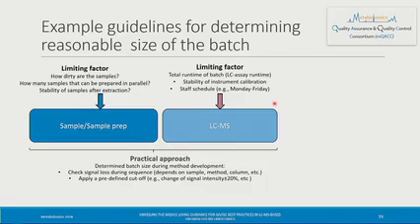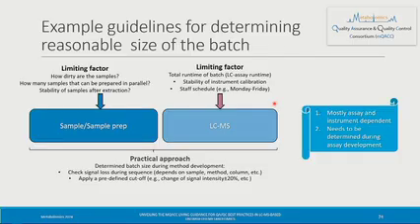There are a variety of things that can limit the size of a batch, and it could be your sample prep, the runtime of the batch, instrument time, stability of the instrument, and work days of the people who are running your samples. So again, during method development, just determine a practical batch size that works for your lab. Most of this will be determined based on the instrument and the assay that's being done, and again, it needs to be determined during your method development.